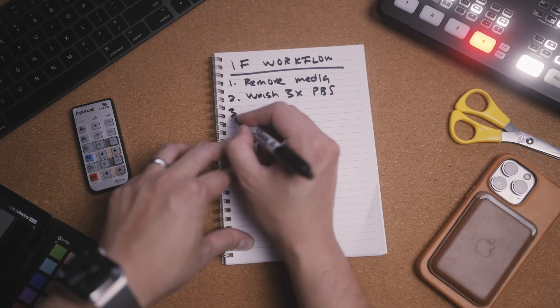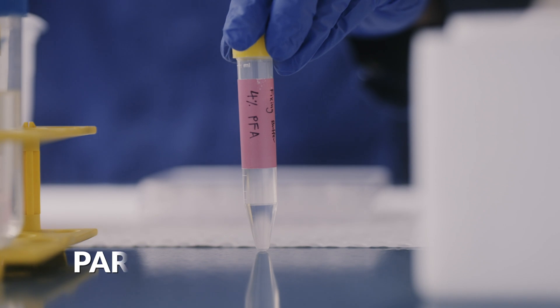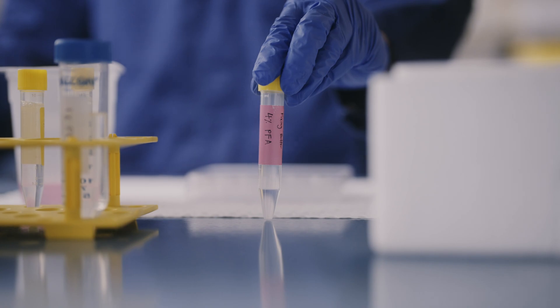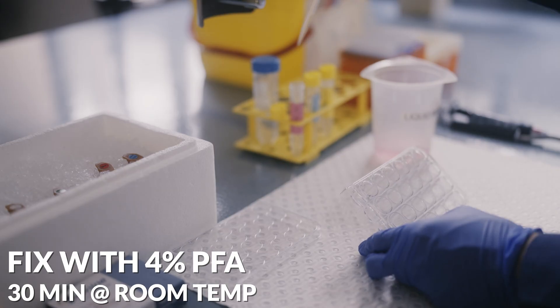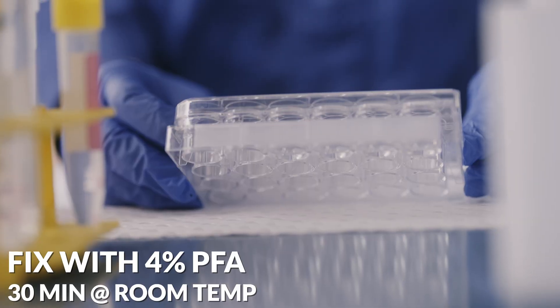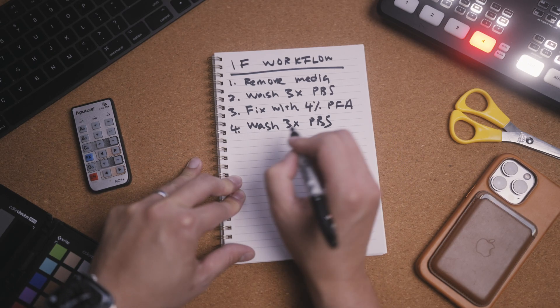The next step is to fix the cells and freeze their activity at a specific moment in time. We can do this with a range of different fixative solutions, but in this case we're using 4% paraformaldehyde, or PFA. The cells are left fixing in PFA at room temperature for up to 30 minutes. Wash off the PFA by doing three washes with PBS again.